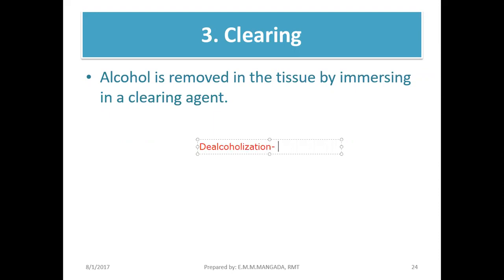Dealcoholization. Okay, so what do you think is the purpose of your dealcoholization or your clearing? From the term dealcoholization, the purpose is, of course, to remove the alcohol. Again, the clearing process is used to remove the alcohol from the tissue. Saan galing yung alcohol? From our previous step, which is yung ating dehydration. 'Di ba sa dehydration ang ginamit natin alcohol. So to remove the alcohol, we use now yung tinatawag naman nating clearing agent.